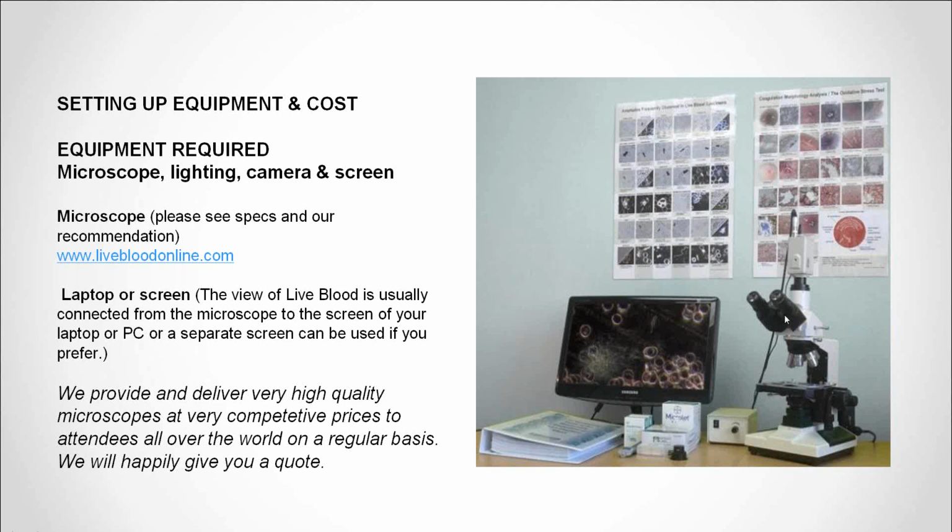So this is the microscope, and you will need a laptop or screen. The view of the live blood is usually connected from the microscope to the screen of your laptop or PC, or a separate screen can be used if you prefer.